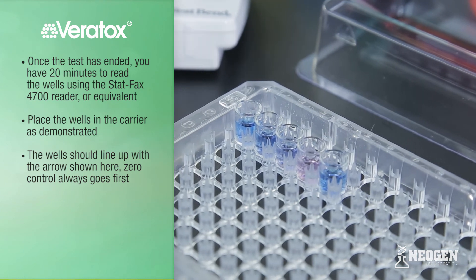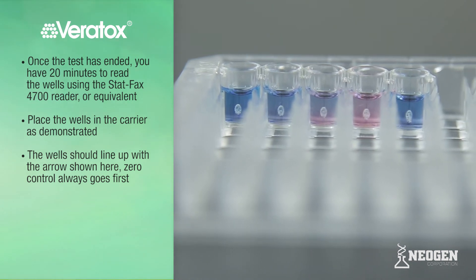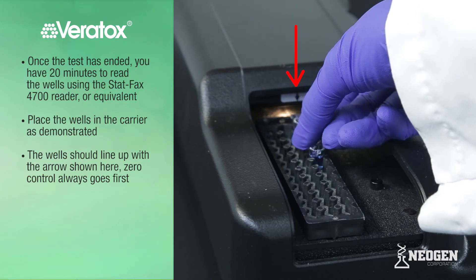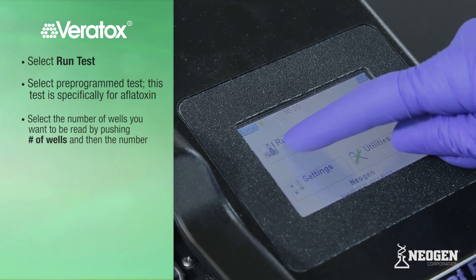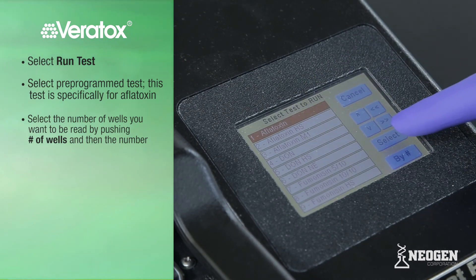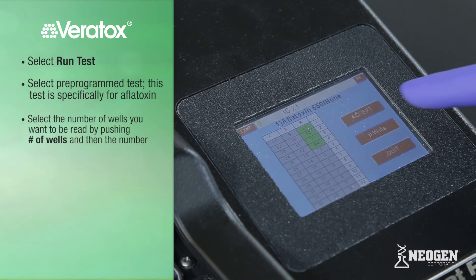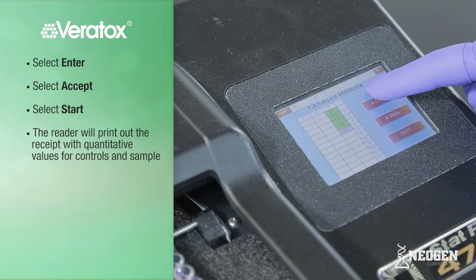Once the test has ended, you have 20 minutes to read the wells using the StatFax 4700 reader or equivalent microwell reader with a 650-nanometer filter. Wipe the bottom of the microwells, ensure that there are no air bubbles, and place the wells in the carrier with the zero control always first. Select Run Test, then select the appropriate test programmed into the reader — for this demonstration, test number one, Aflatoxin. Select the number of wells to be read by pushing Number of Wells, then the number, and select Enter. Select Accept, then Start.